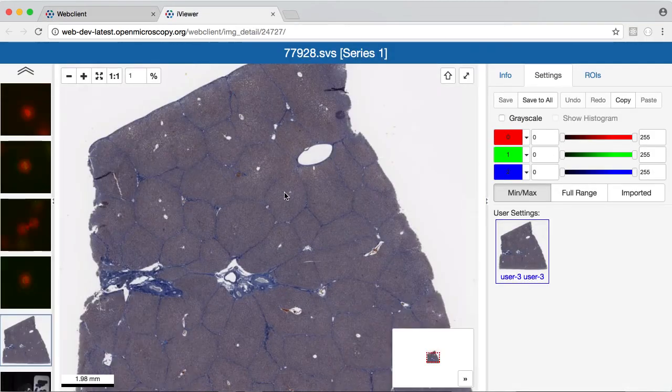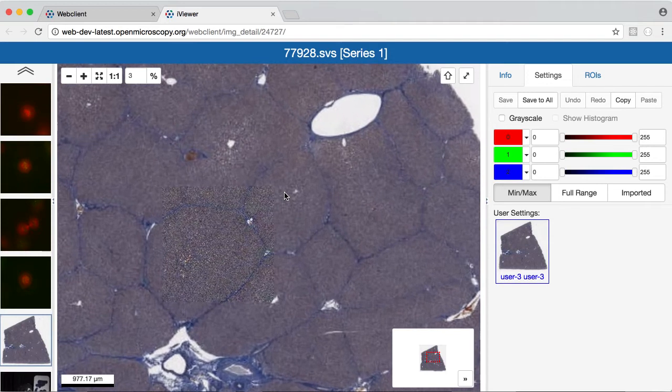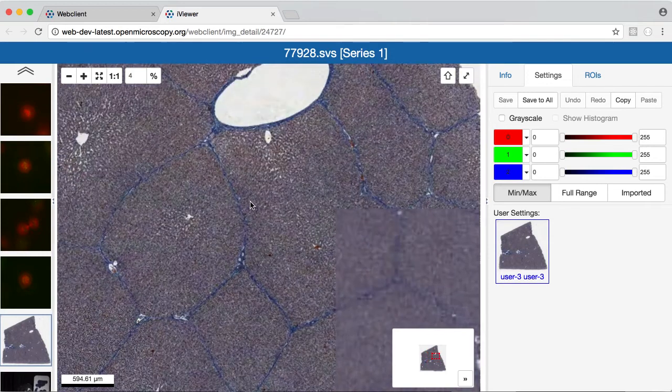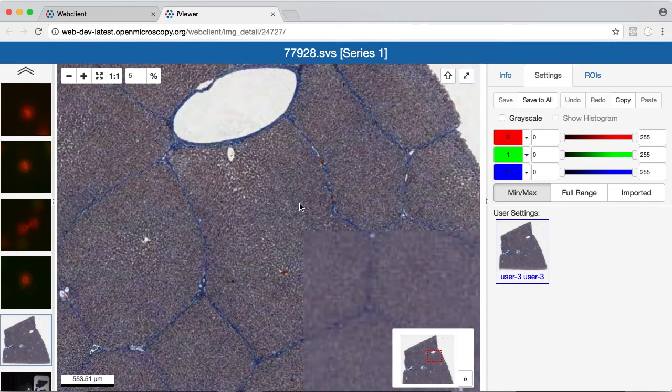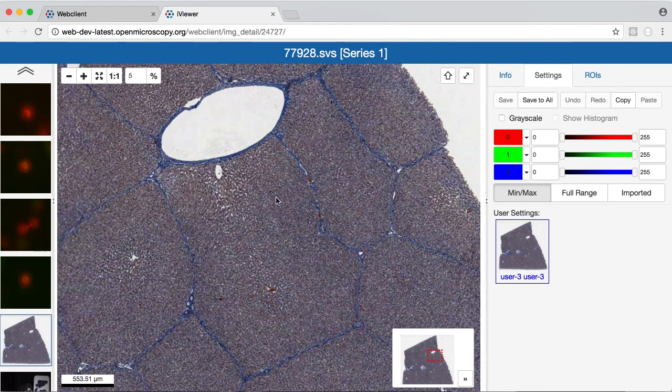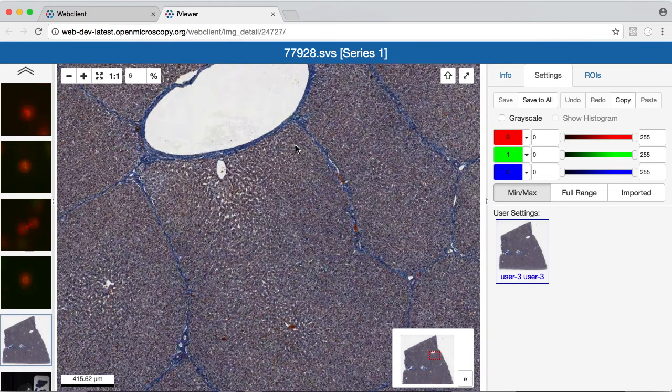As you can see, we support both big tiled images and smaller images, and we're using the OpenLayers canvas to support that.